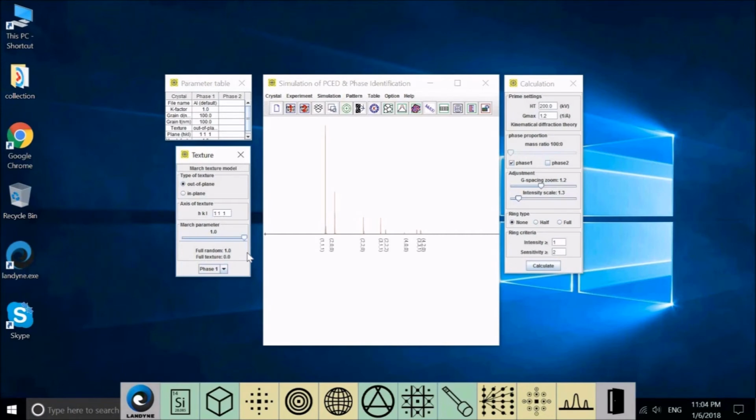So there are two different geometries. For totally random patterns, you can use the powder X-ray diffraction pattern to index the electron diffraction pattern. There is no difference. But once they have texture, these two experimental results will show differences because of the texture.